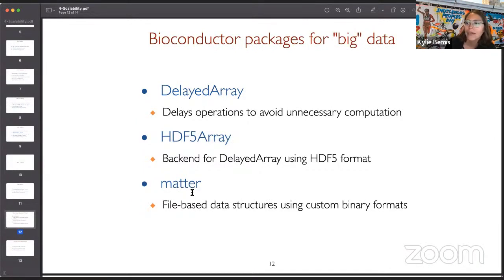it allows the user to specify from a lot of different custom storage formats. It doesn't use any particular file format, but it allows you to specify exactly where the data is stored if you want. I designed this package specifically with the needs of mass spectrometry data, specifically mass spectrometry imaging data, in mind. So it's designed to handle some of the requirements of a file format like imzML.